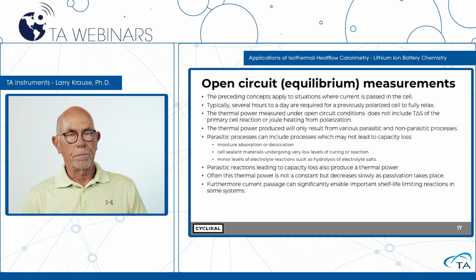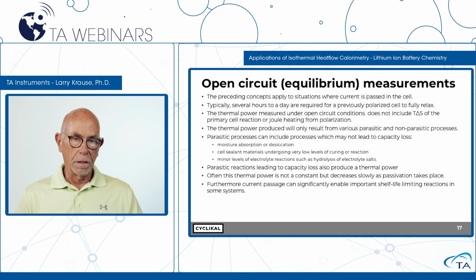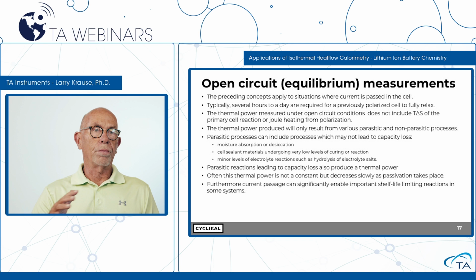Furthermore, current passage, actually running the battery, can change these parasitic reactions that degrade the capacity. So if the battery is sitting very quiet, it may not be losing capacity, or the shelf life might be very good. Start the battery up and run it again to do energy, and you can now accelerate those parasitic reactions that were not taking place when it was just sitting there.